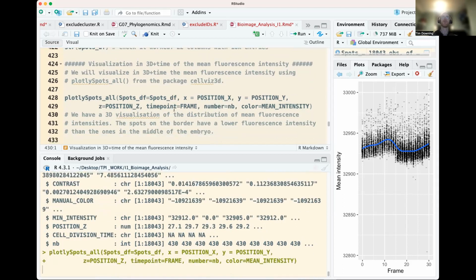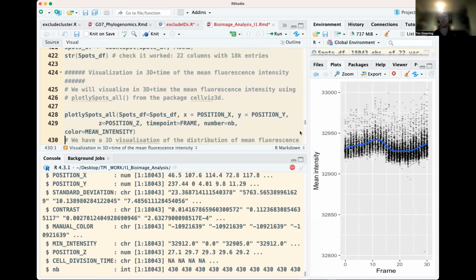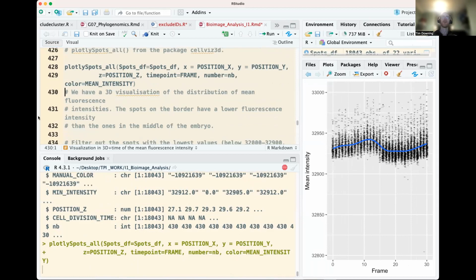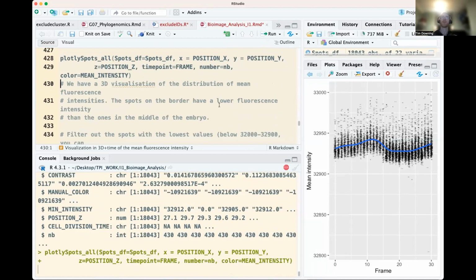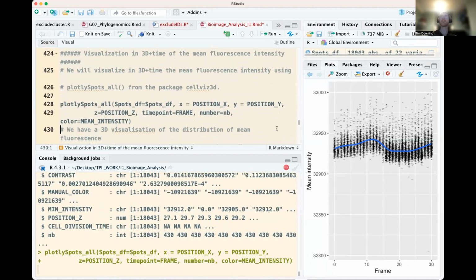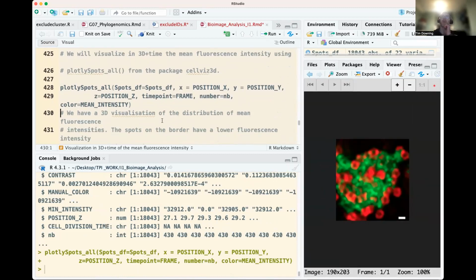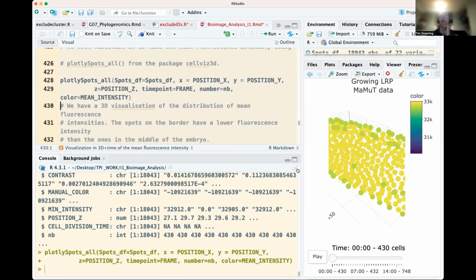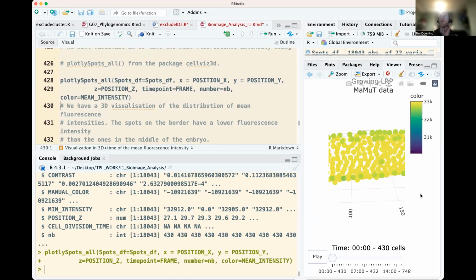If we plot this 3D visualization, we'll see a plot on the right-hand side that we can explore more fully. We just make this a bit wider so we can see it properly. These things take a while to produce because they're complex images. So there we have our graph on the right.